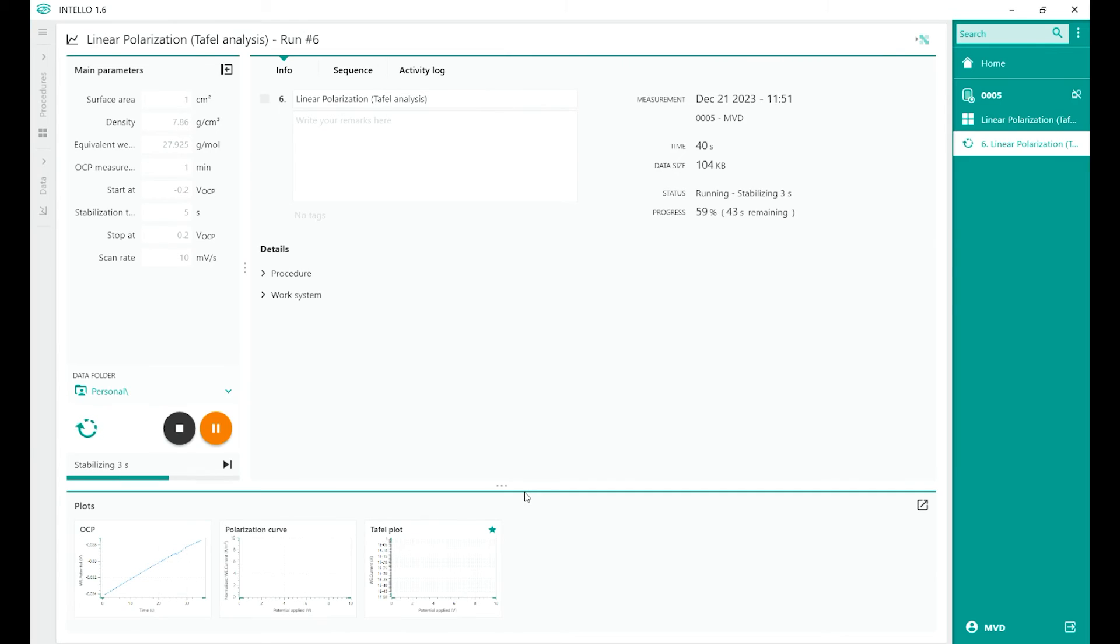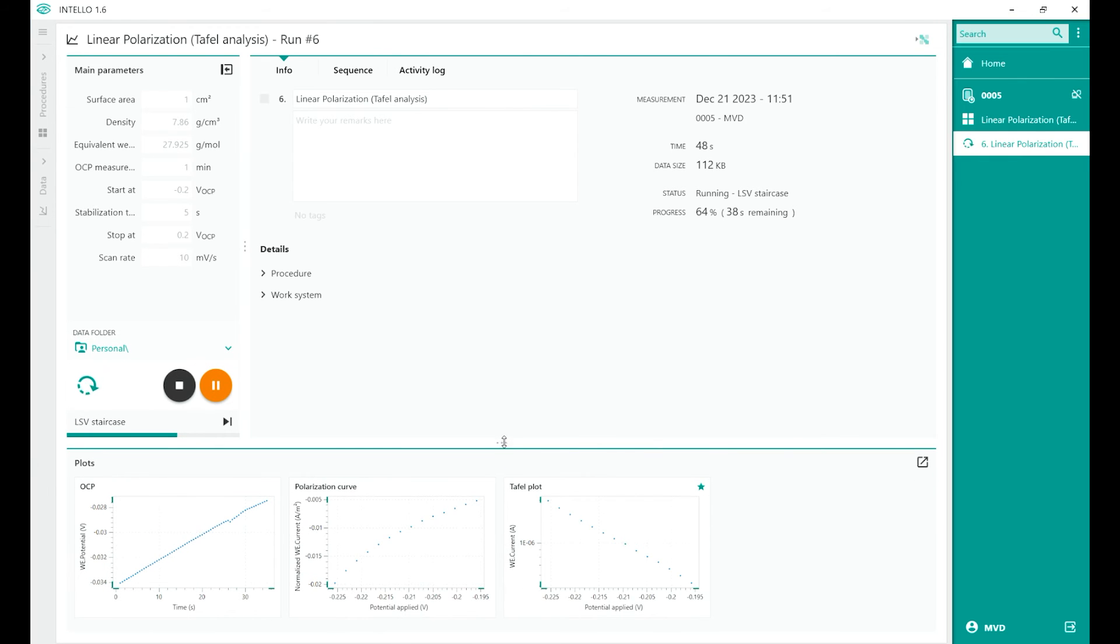The measurement starts. Then we will see a polarisation curve. You already see a TAFEL plot appearing. From the TAFEL plot, we can do the TAFEL analysis. In order to perform the corrosion rate analysis, the linear regression of the anodic and the cathodic side of the TAFEL plot must be specified. This is accomplished with the help of four markers, two per anodic side and two on the cathodic side.